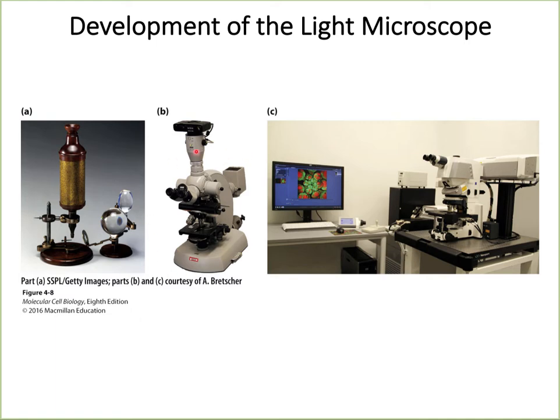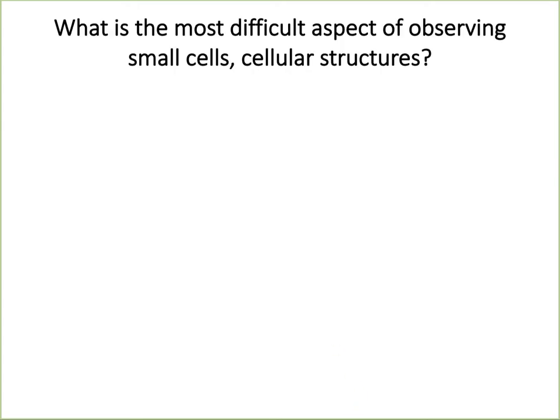But we are only going to talk about the Brightfield microscope in this section. We are going to talk about fluorescence and the other types of microscopy, which also use light but are more sophisticated, in section 2B of this talk.